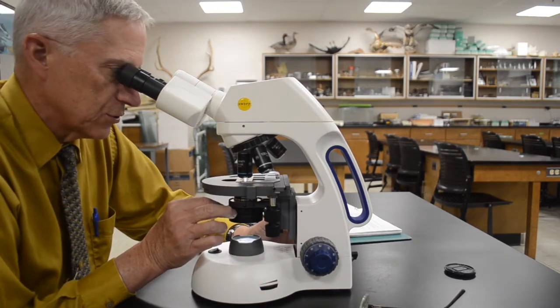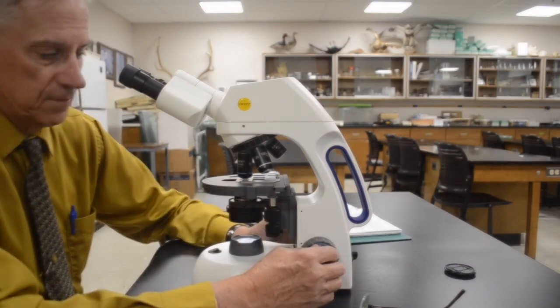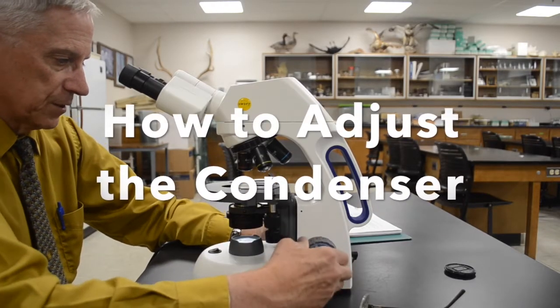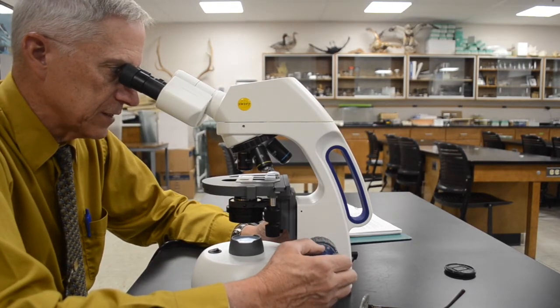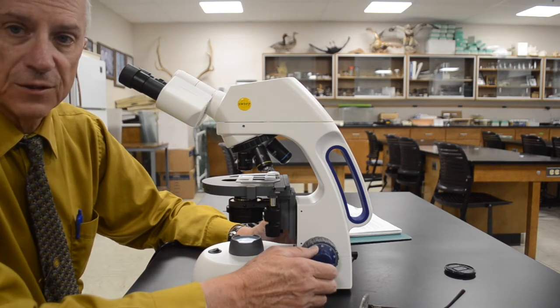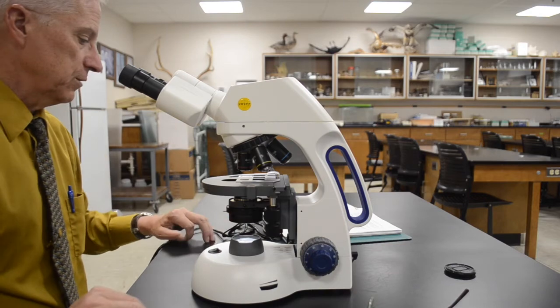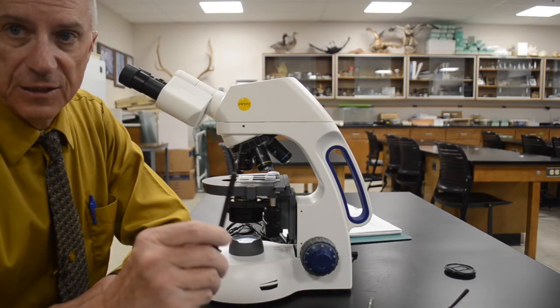Also adjust your condenser diaphragm as well. I need to show you one more thing: how to focus or adjust the condenser. Most people are never taught how to do this. What you'll need is your microscope and a fine-tipped probe.